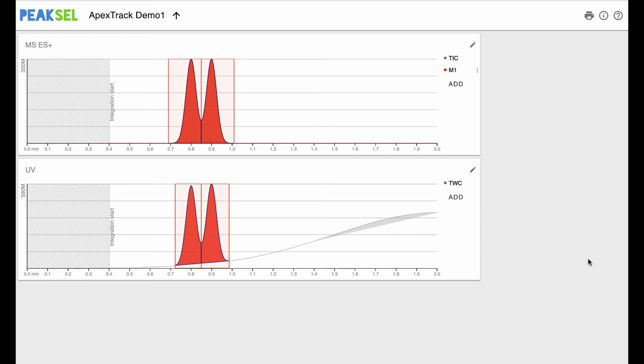So whether the baseline is located correctly or not can depend on parameters which seem to be unrelated to baselines. Another problem that you may have noticed is this area.